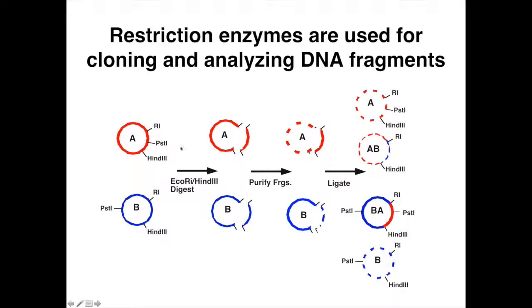They're purified from bacteria, and we use them because bacteria naturally have the ability to cut DNA at specific restriction sites. So by doing this, if I digest my samples, so let's say I have these two plasmids, and I digest my samples with EcoR1 and HindIII, that's a double digest. So I put two enzymes in. It is only going to cut where the R1 sites are. So here's an R1 site. There's an R1 site on this plasmid. And the HindIII is down here on this plasmid A, and again, it's on plasmid B.